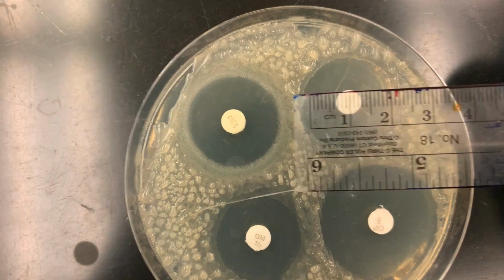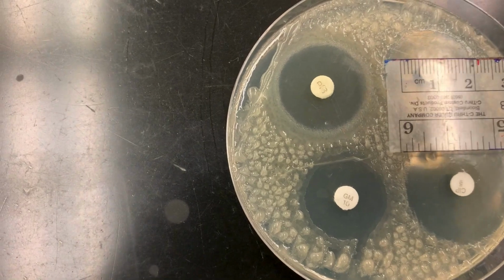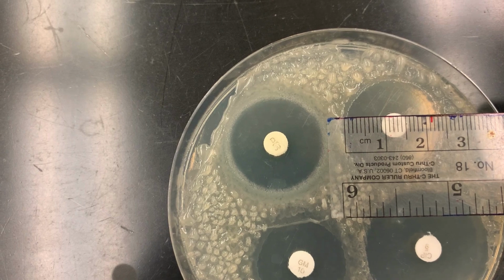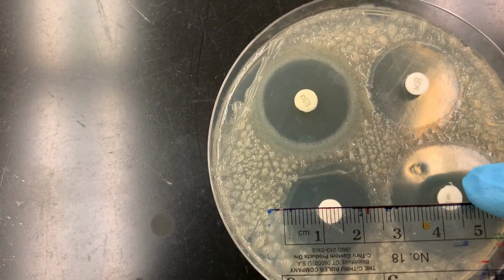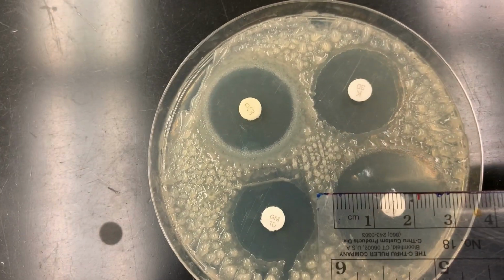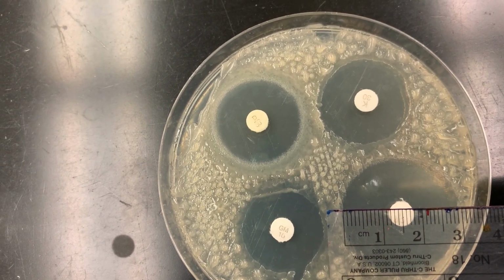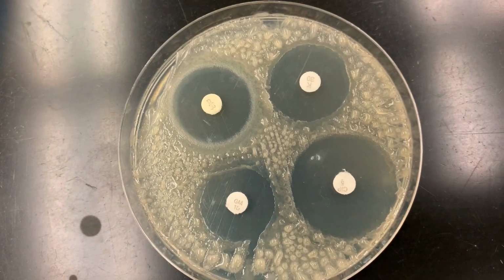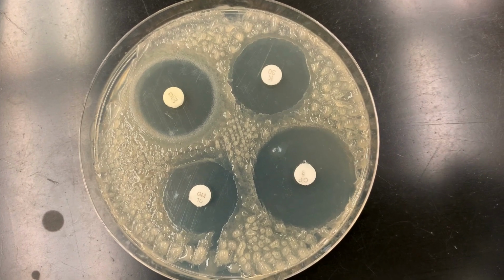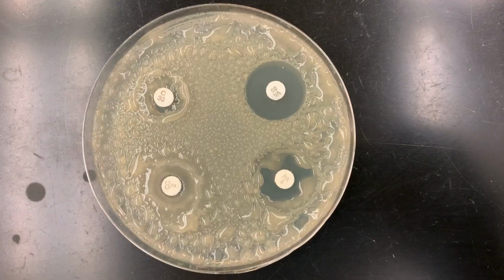and interpret. The next antibiotic is K. It's kanamycin. I will hold up the ruler. Let me get it lined up. There you go. The next antibiotic down here is gentamicin. And our final antibiotic over here is ciprofloxacin. So based on the diameters that you read from the ruler and the table that I've provided to you, can you tell whether or not bacillus is sensitive, intermediate, or resistant to these antibiotics?